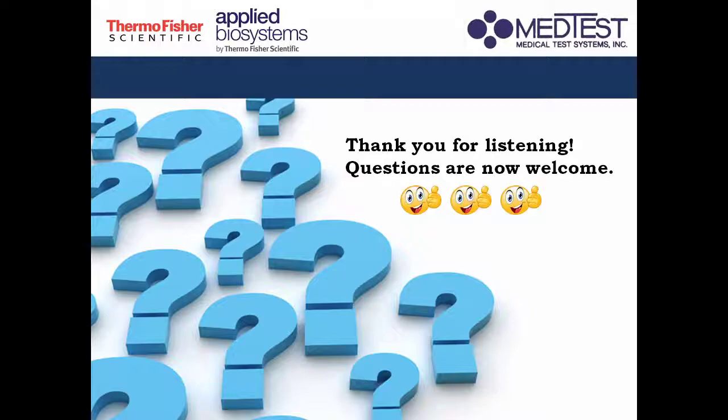Yes po. So normally, for the software of the Quant Studio 5, medyo maganda na kasi yung automation ng data analysis ng software. So, bihira lang din yung kailangan mag-intervene dun sa software.